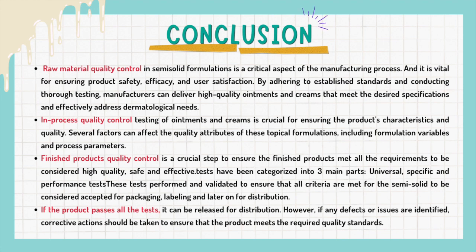If the product passes all the tests, it can be released for distribution. However, if any defects or issues are identified, corrective actions should be taken to ensure that the product meets the required quality standards.